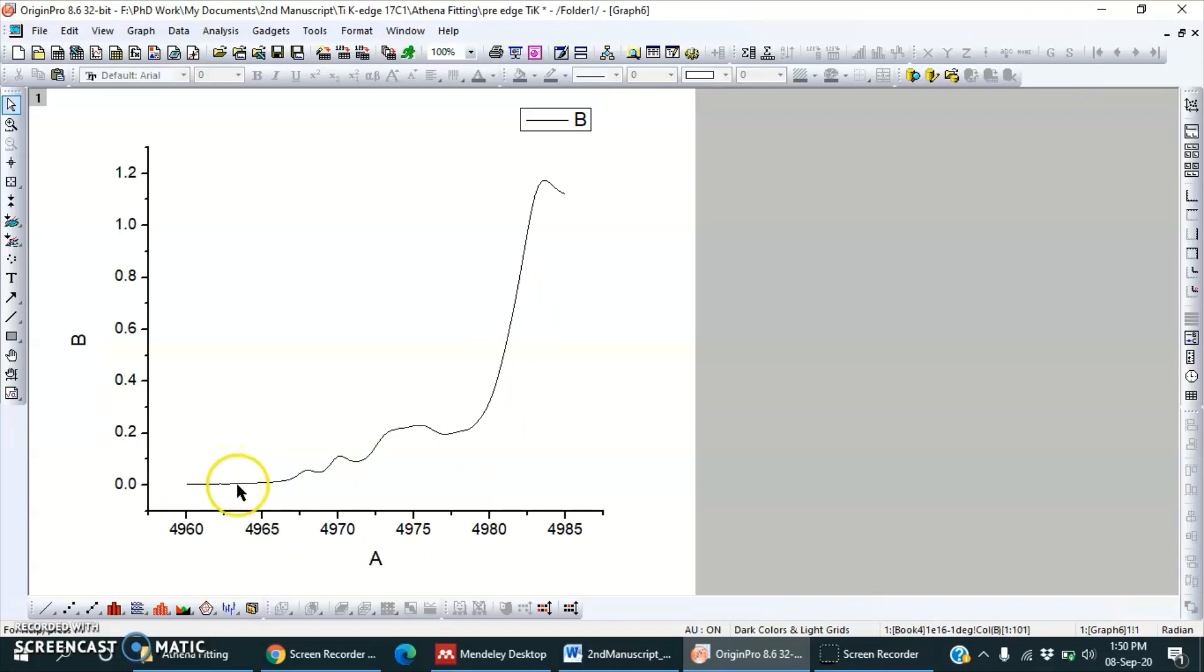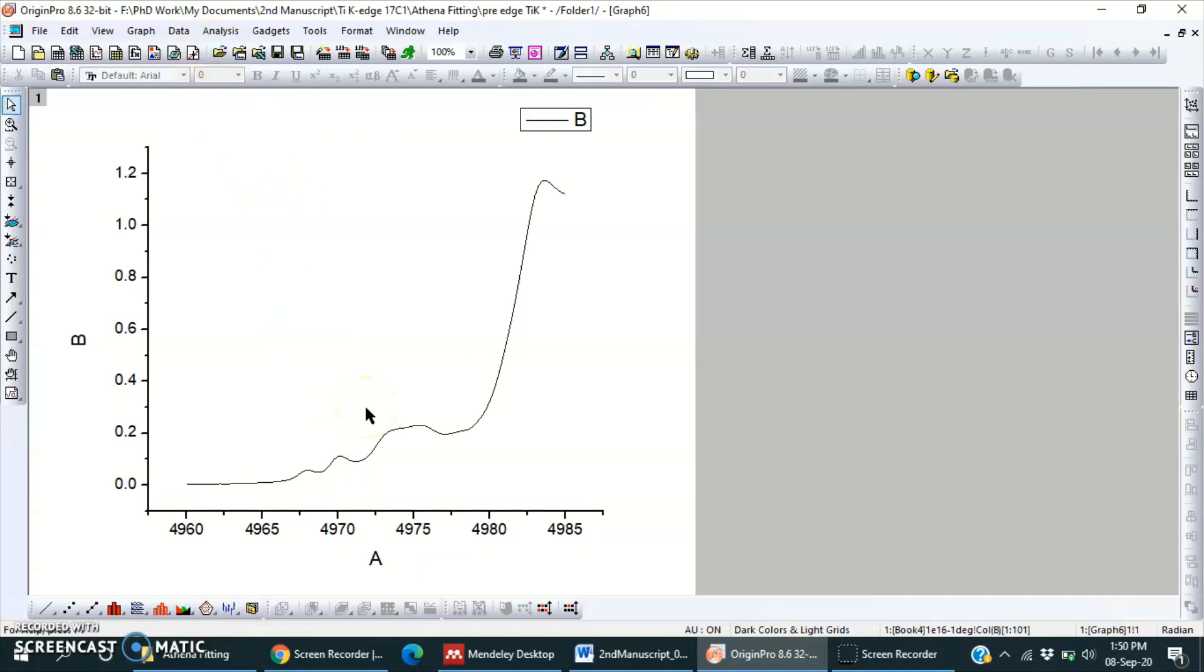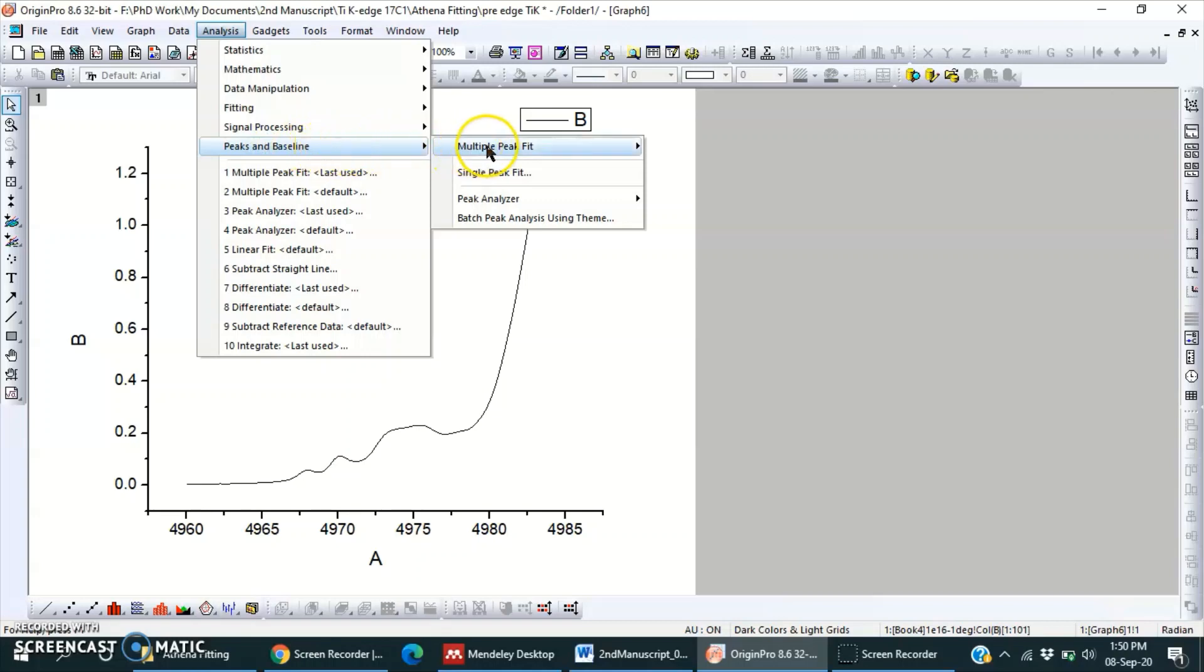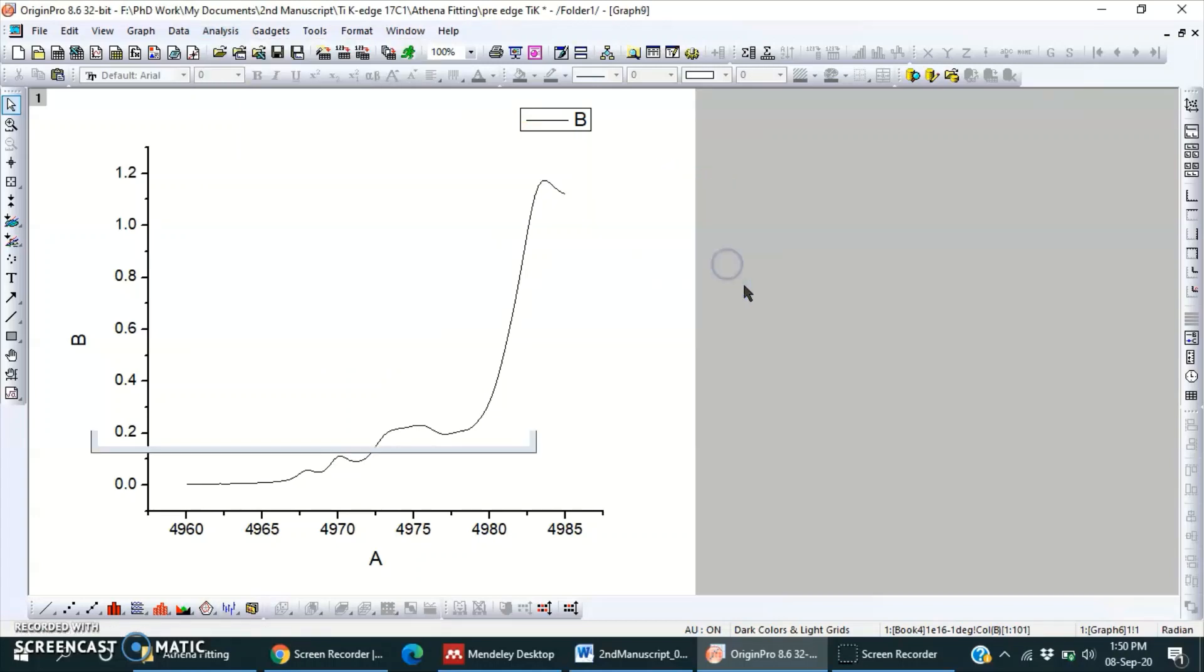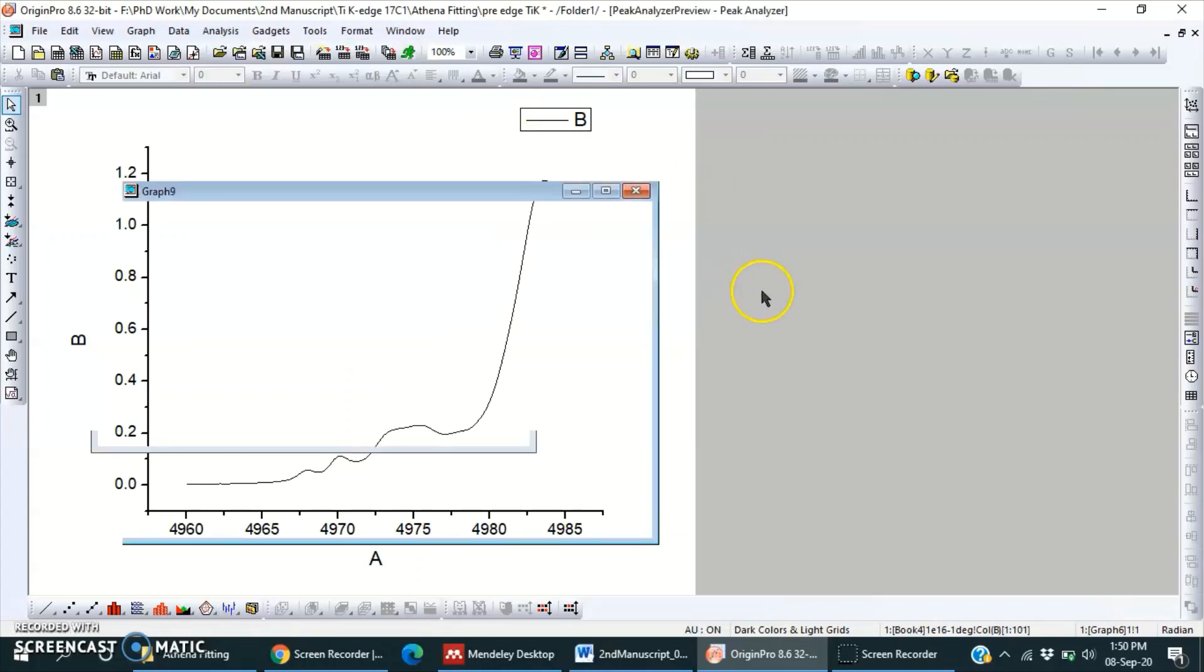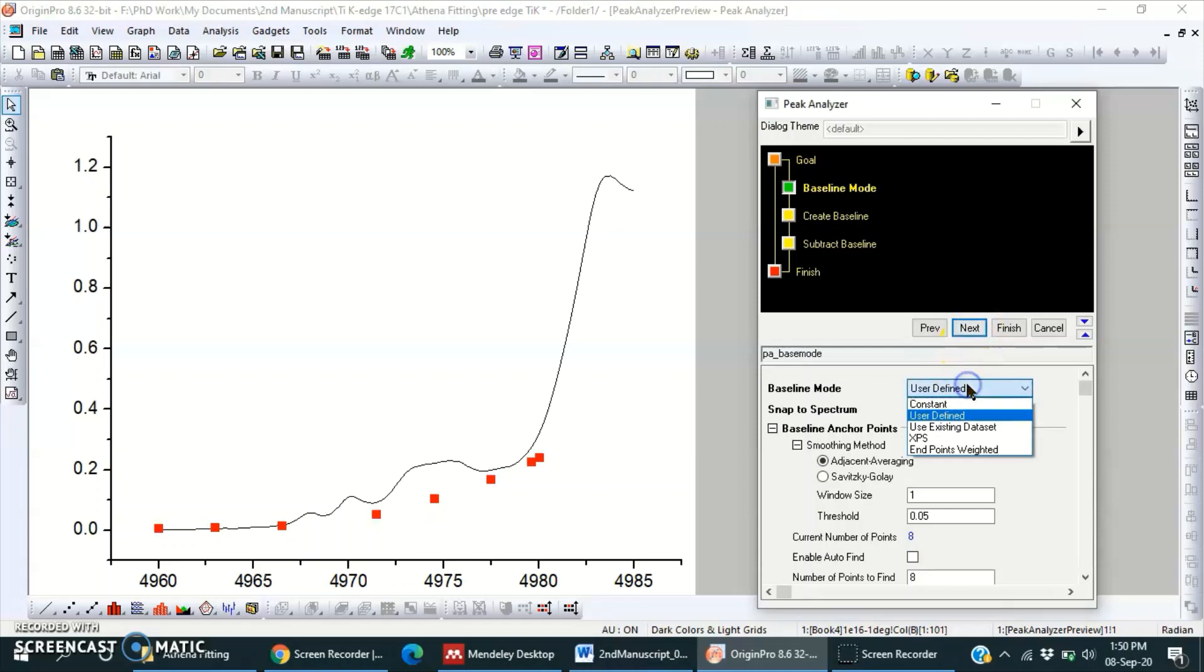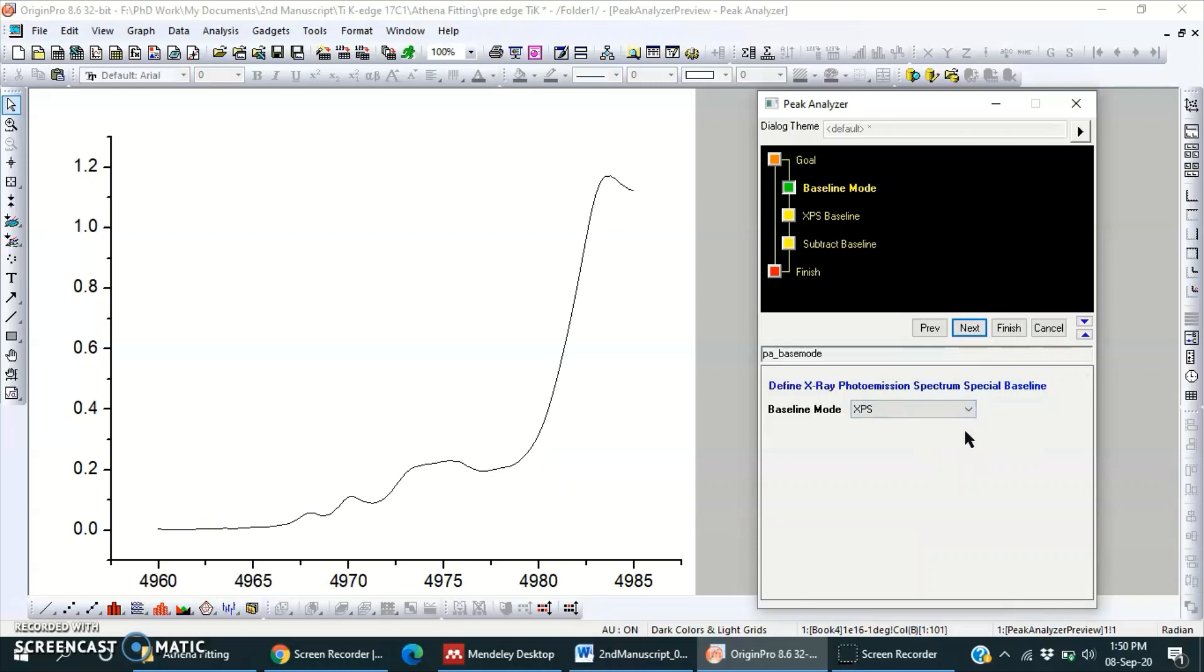So I feel that I should use Origin software to fit it. Here we can use Shirley baseline for this region. Choose Peaks and Baseline, then Peak Analyzer, open dialogue, yes, go further. Then here, user-defined, so we should choose XPS.